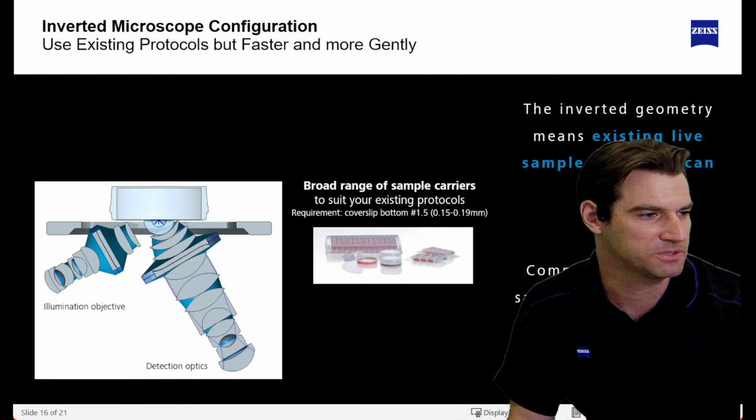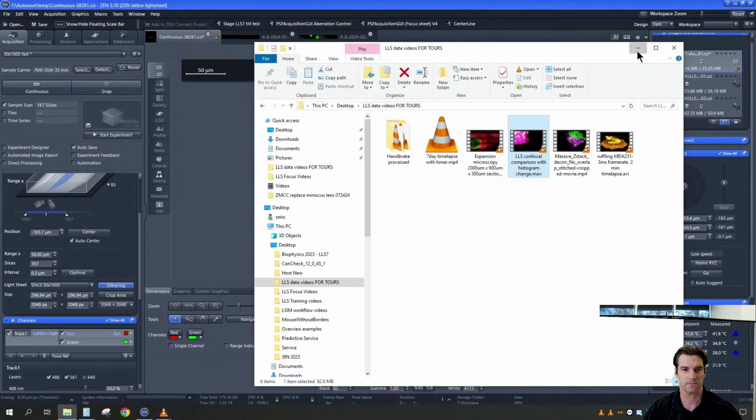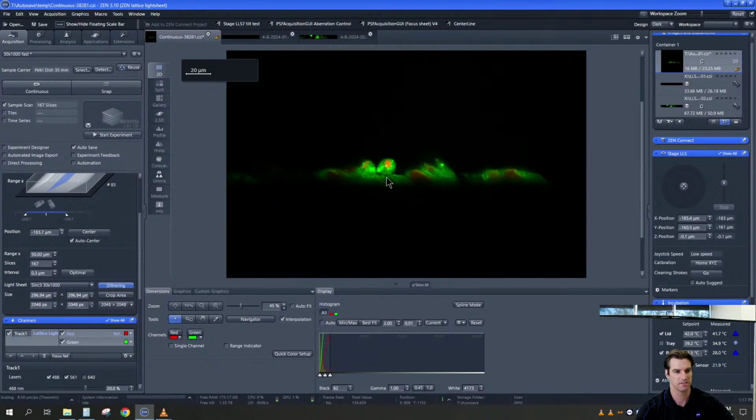So we'll go back to our desktop, and now we'll hop into the software. And what we're looking at here on the screen is the view of that camera. We're looking at a 30-degree cross-section. If we're going from bottom to top here, then in a moment we'll be looking at these cells live. This is the bottom of the cells and going up through them at a 30-degree angle. We always have people take a few minutes to get used to looking at the 30-degree angle, but I want to show why that's so great.